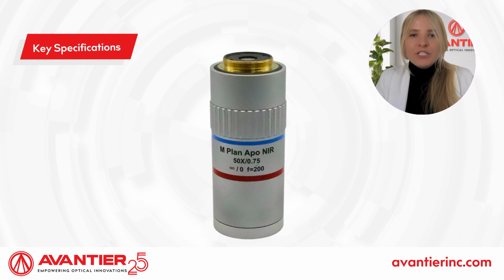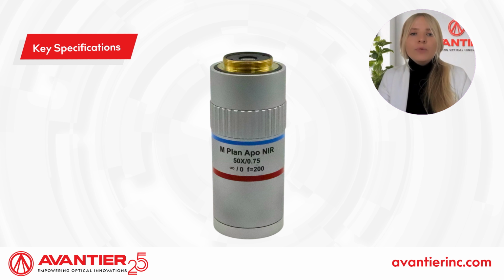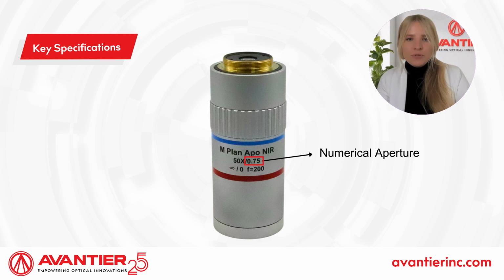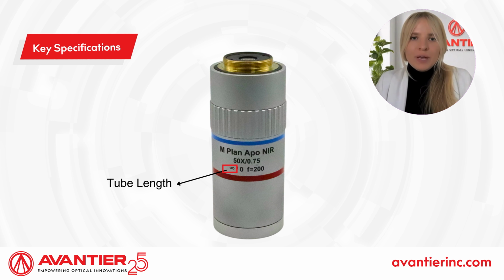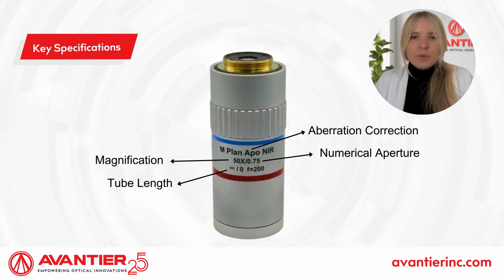Now let's talk about some key specifications imprinted on objective lenses. These details help researchers select the right lens for their experiments. Look for numerical aperture, NA, which defines light gathering ability and resolution. Magnification determines the number of times the image is magnified. Optical tube length ensures compatibility with the microscope setup. Aberration correction improves image quality for clearer observation. These markings, often found on the lens barrel, help users better understand the lens capabilities and ensure optimal performance when paired with the ocular lens.